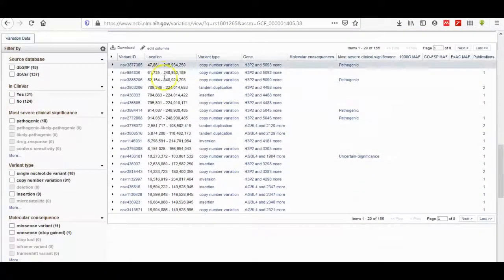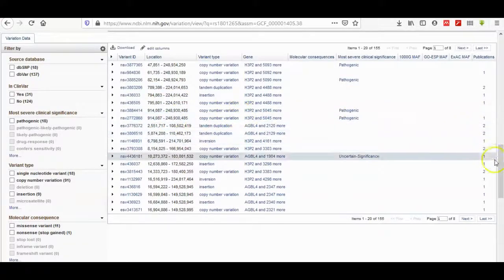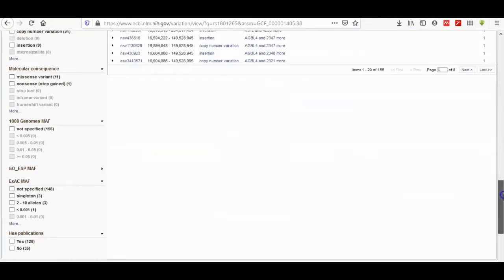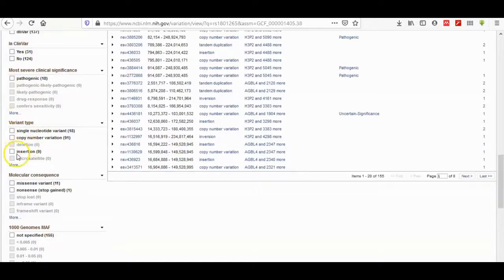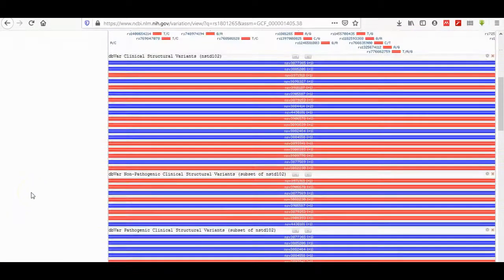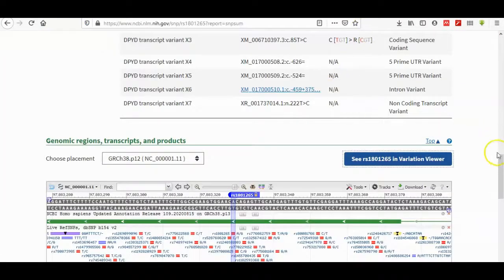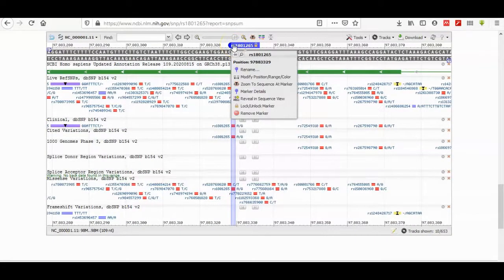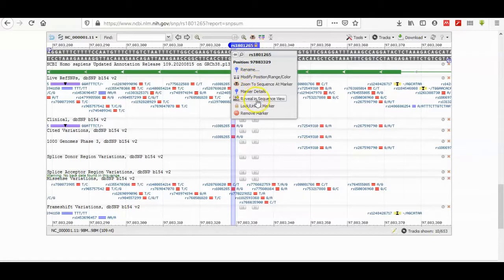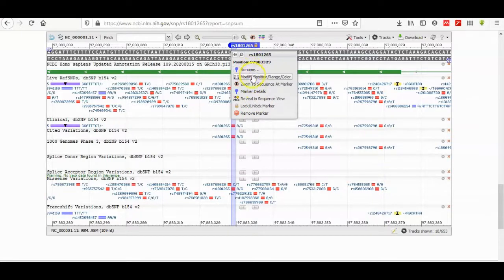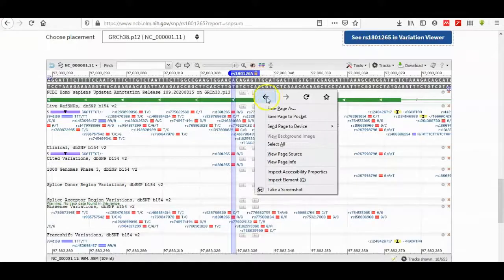Here is the information that belongs to any sequence that is represented in this list. Here is, as any database content, a filter of this page. You can get back. If you click here, modify position, zoom to sequence, markers, details, reveal in sequence view, you can rename, you can modify position range, color, or zoom, or marker detail.